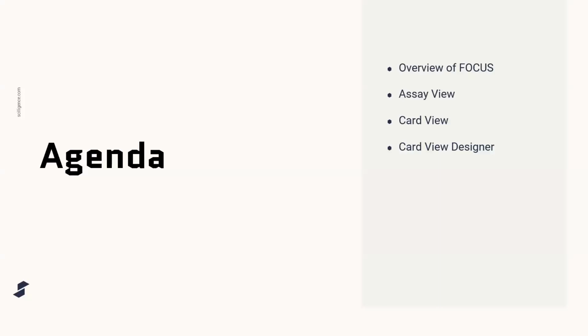Yeah, so for those of you who are not familiar with FOCUS, I'll give a brief overview of this module that we have, a web-based module. I'll go into describing Assay View. Those of you who have Regmol will be familiar with Assay View. We have the same functionality in FOCUS. And then I'll get into the development of Card View, which is designed to be a complement to Assay View.